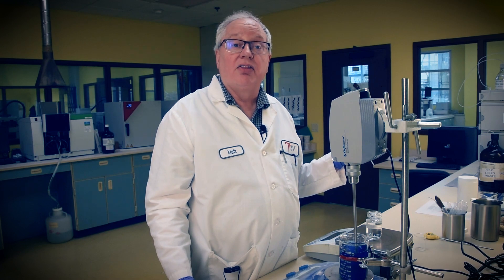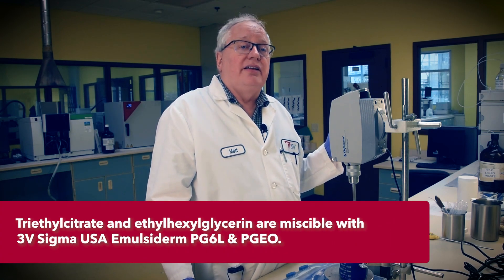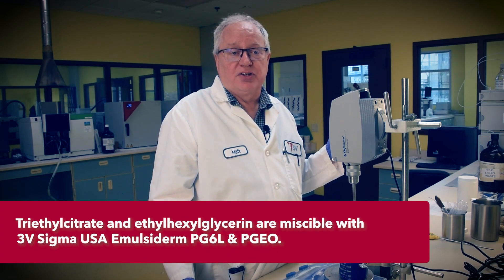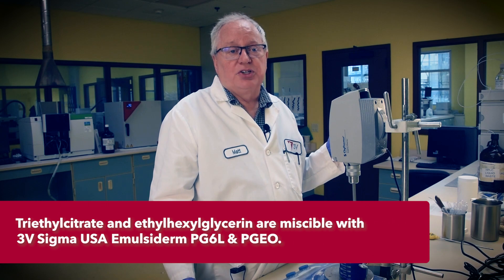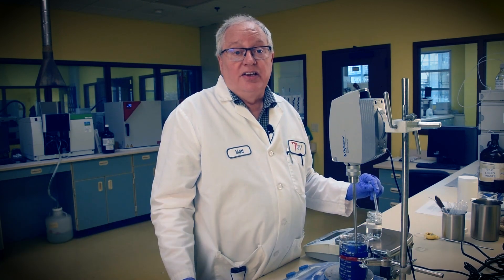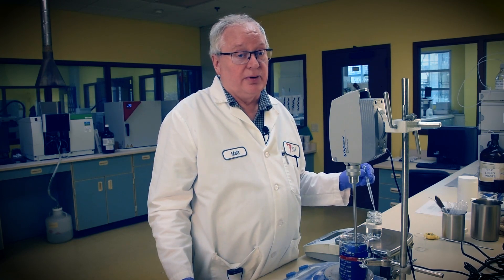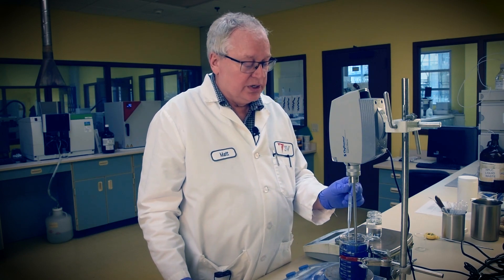Both of our Emulsiderm PEFAs are readily miscible with the glycols, which helps convey the final deodorizing ingredients. Triethyl citrate and ethyl hexylglycerin each have unique properties for personal care applications but share the quality of deodorizing or neutralizing foul aromas. These are fragrance fixatives too, and when holding a stick batch at 65°C for 8 hours during the filling process, we need all the fixation we can get.